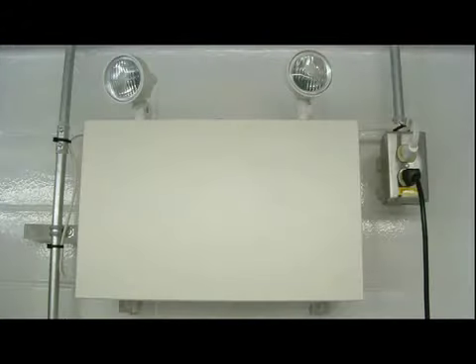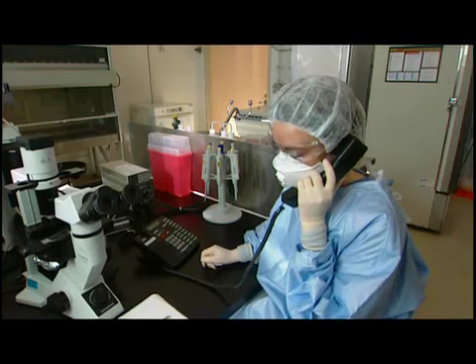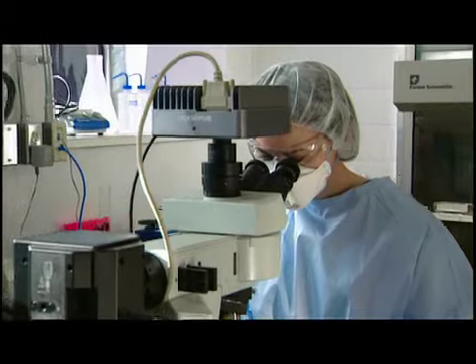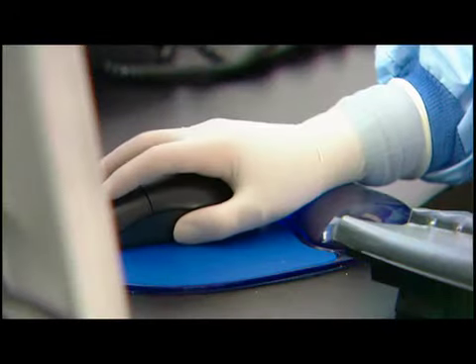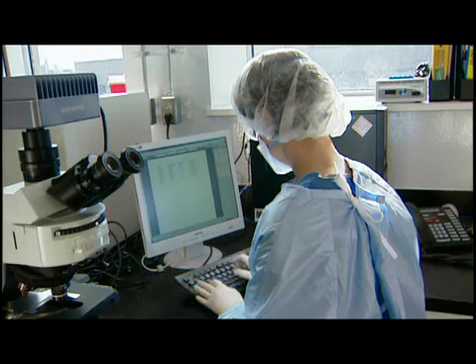Emergency lights and a source of emergency electrical power are necessary to maintain all systems that are vital to maintaining containment of the lab. In an emergency, as well as in day-to-day work, you need some way to communicate with the outside, such as a telephone, a fax, or even email. In addition, you need an efficient way to transfer your information and data to the outside. Remember, you can't physically carry anything out which hasn't been properly decontaminated first. This includes paperwork.